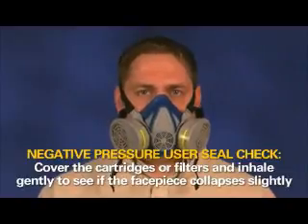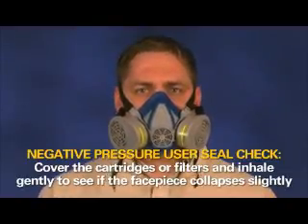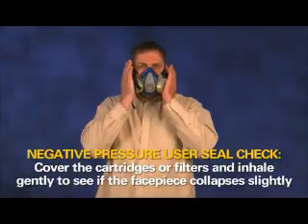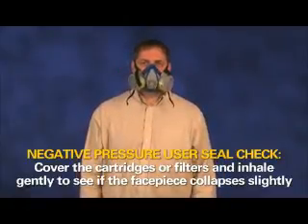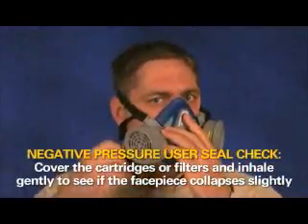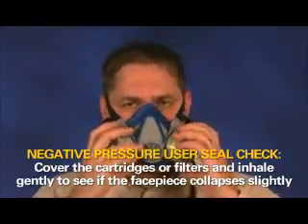Next, perform the negative pressure seal check. Cover the respirator cartridges or filters with the palms of your hands. Inhale gently. If you feel the facepiece collapse slightly and pull closer to your face with no leaks between the face and facepiece, a proper seal has been made. If you detect face seal air leakage, reposition the respirator on your face and readjust the straps, then recheck.